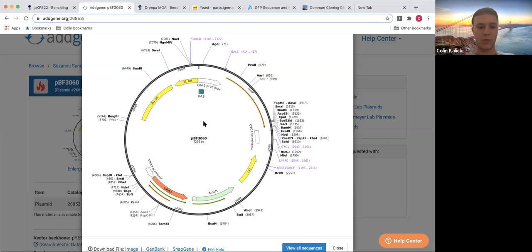All right, let's continue. So with this, we have this AMP-R, ampicillin resistance. Now, why would you want this? Why is this important? Why would I want, in my plasmid, the central dogma, so you're going to go plasmid to RNA to protein, why do I want them to have protein that resists ampicillin? Why do I want to code for that in whatever species I have?